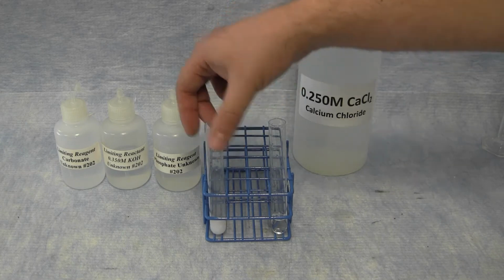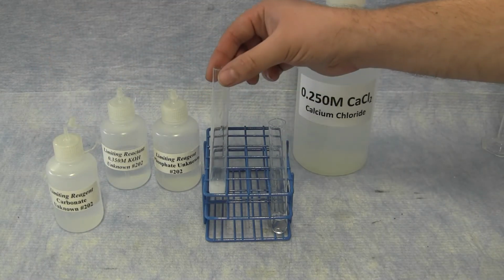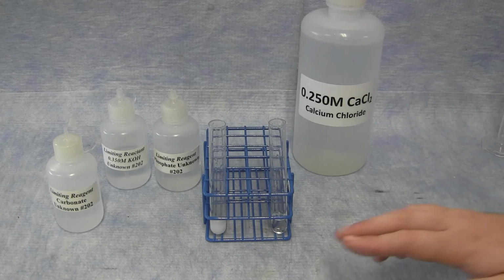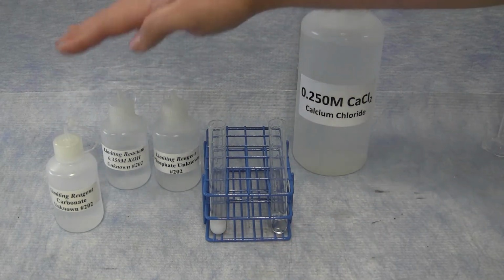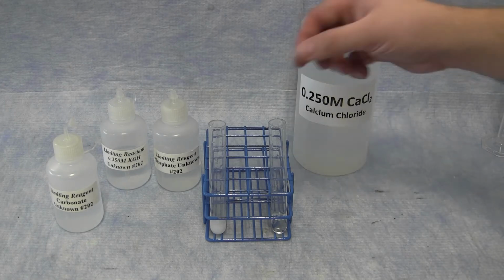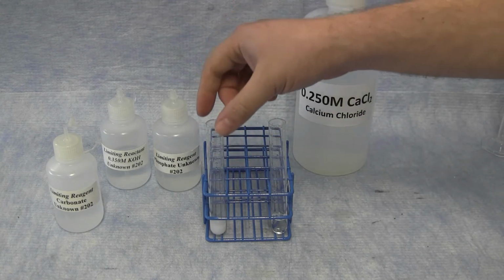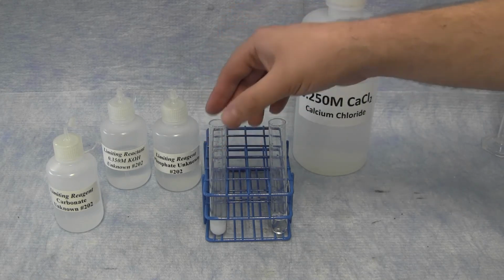With the addition of extra carbonate unknown, a reaction occurred, meaning there was extra calcium chloride in the filtrate, and when the carbonate was added, the reaction could continue and form the precipitate. In this setup, the carbonate was the limiting reactant.